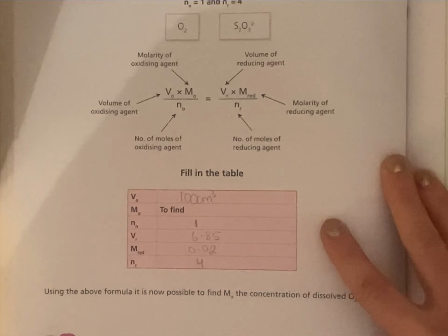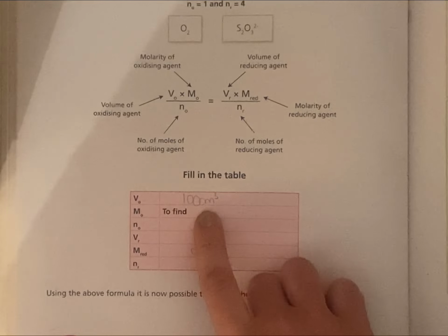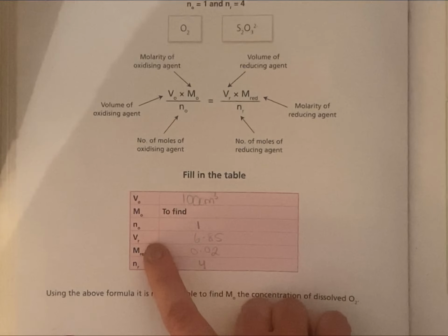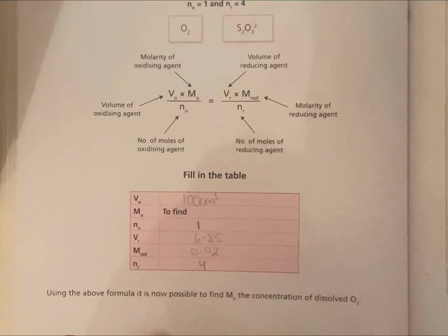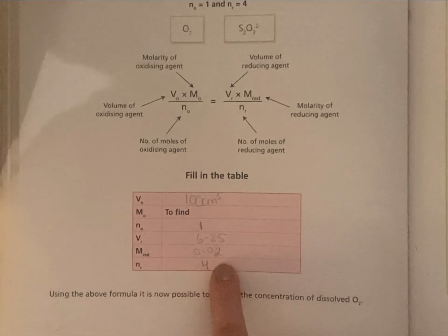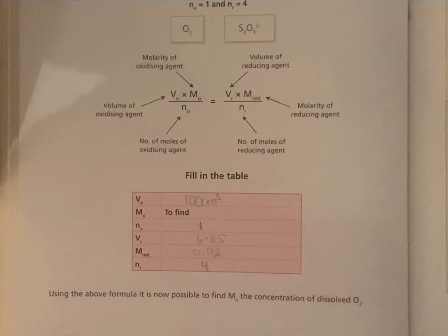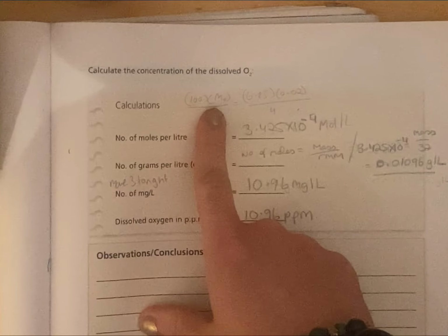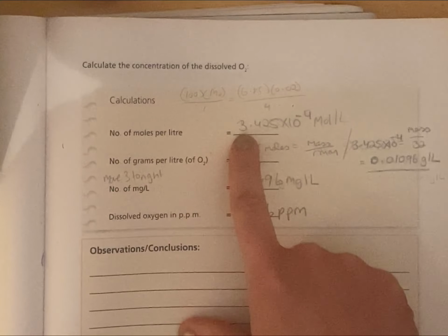Once we have that, we can fill in our table. We used 100 centimetres cubed of the water. The number of moles for the oxidizing agent, oxygen, is 1. The number of moles for the reducing agent is 4. That's what we just worked out. This is your average titer, and this is the molarity of the thiosulfate that you used. So the only thing we need to find is the molarity of the oxidizing agent, basically the concentration of the oxygen in our water sample. So we'll go over here and work out our calculations. We're using that formula. The only thing that's missing is the oxidizing agent. This is my number here.